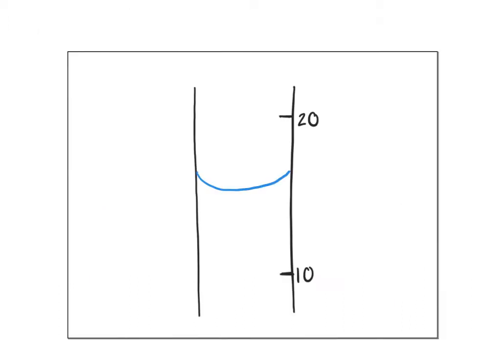I often have kids ask me, well, what would the markings have to look like if there were no decimal places? The only way we would have no decimal places is if I had markings every 10 milliliters. So 10, 20, I am certain of the tens place, and so I'm going to estimate the ones place. And so in this case, it would be like 17 milliliters. So I'm estimating that 7. I know it's between 10 and 20, but I'm not sure exactly if it's the 7, the 6, the 5, so that ones place is estimated. So not very precise, because I'm estimating the ones place, and that would be markings every 10 milliliters.